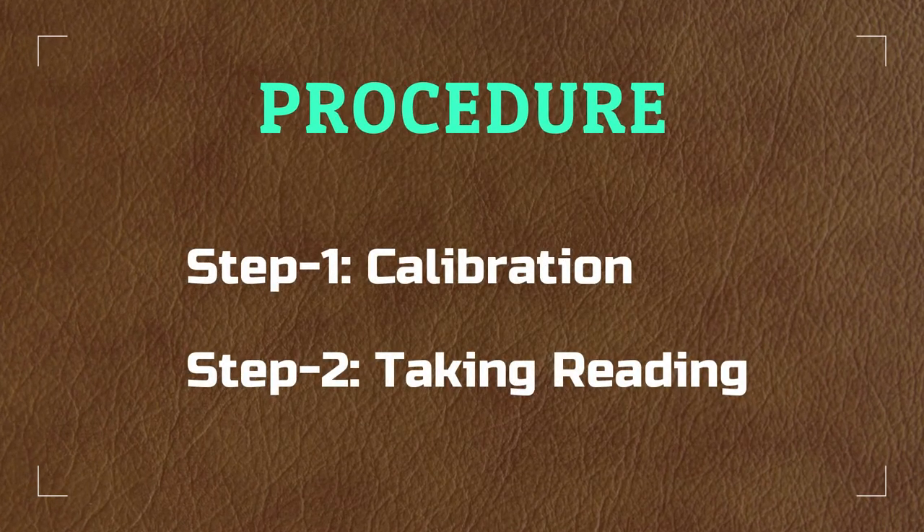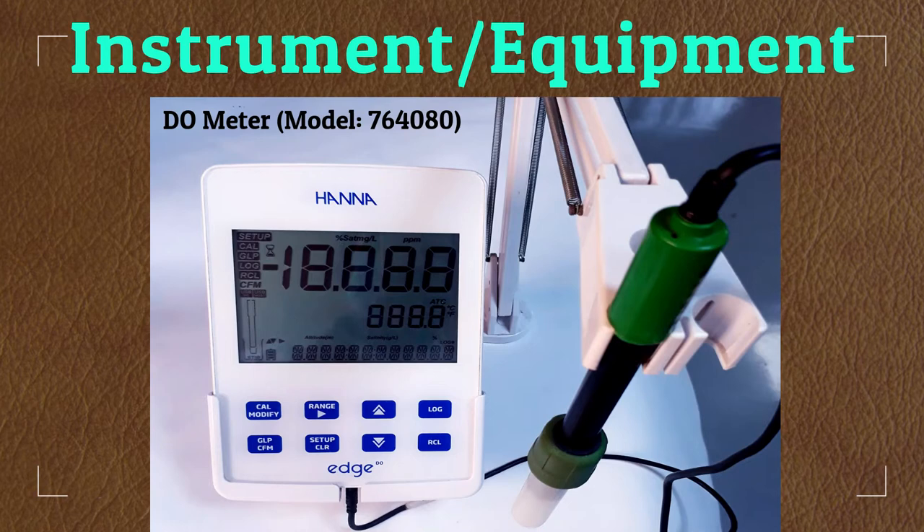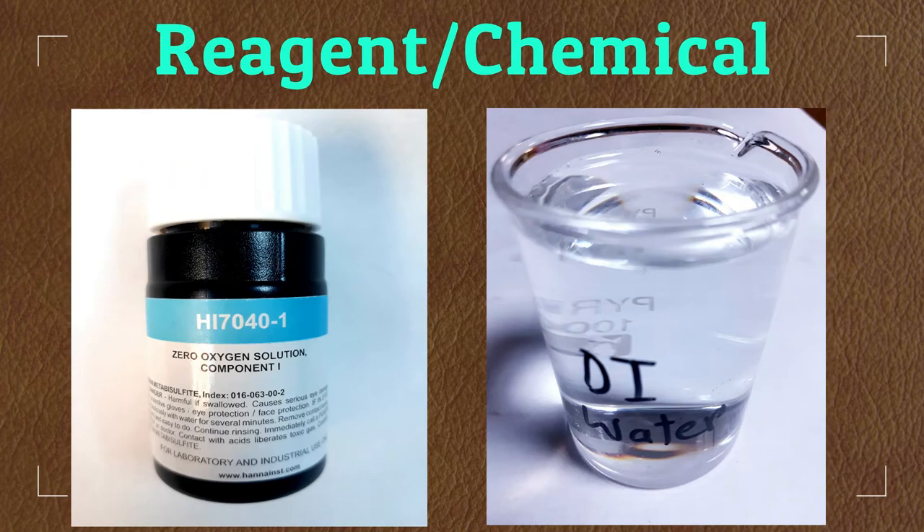The test involves only two steps: instrument calibration and taking reading. To conduct the test we need a DO meter, zero oxygen solution, and deionized water.